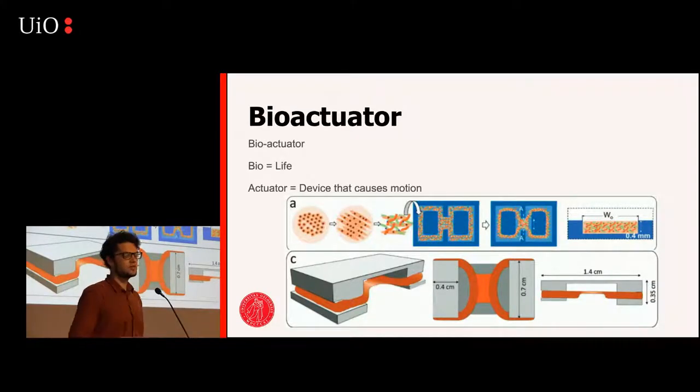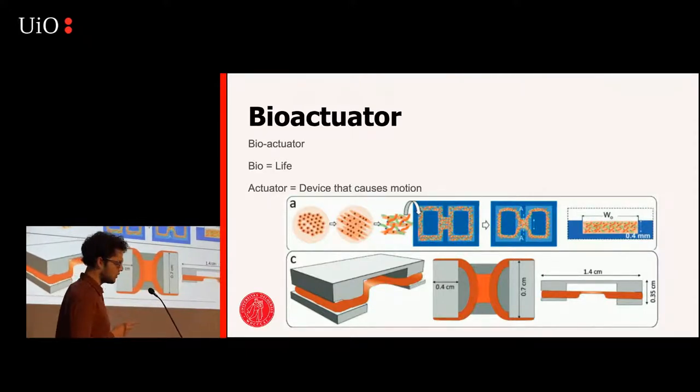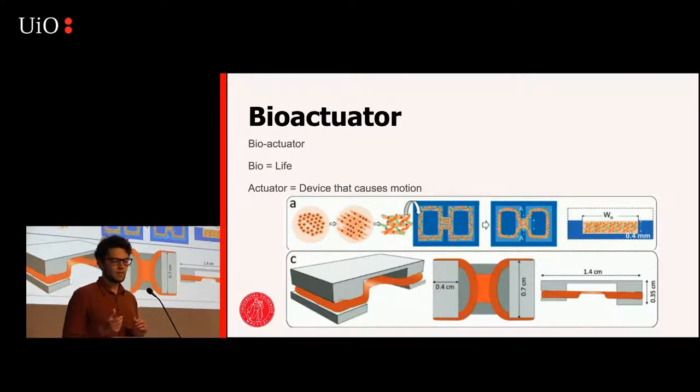What we do in the bioactuator project is that we make these bioactuators, which is pretty much a tiny muscle robot. How we make them is that we first have these muscle cells that we grow and put in a mold in order to shape them to the form we want. We then let them differentiate, and finally they become fully contractible muscle tissue. We then attach it to some sort of skeleton body type thing.